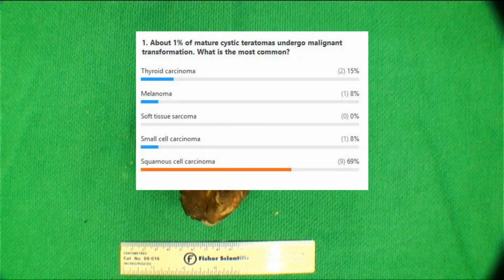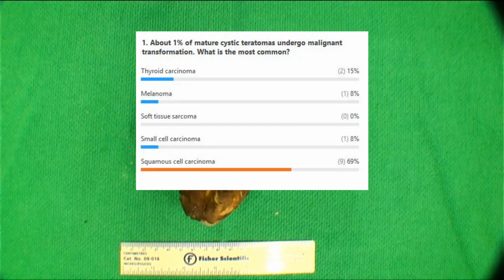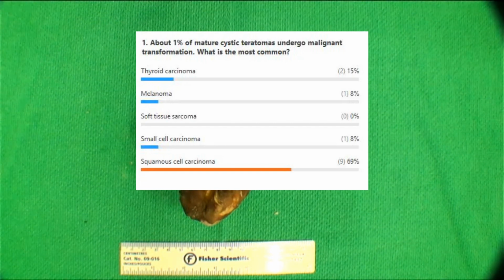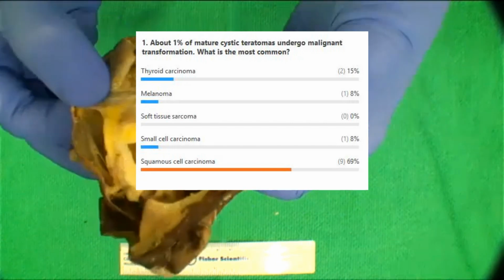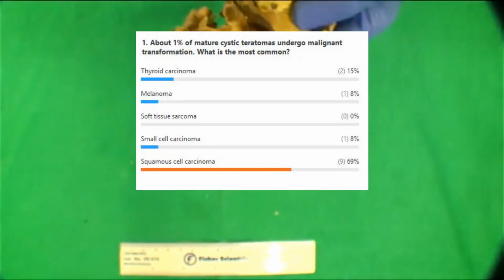Okay, about 1% of these dermoid cysts undergo malignant transformation. What is the most common? And it's for this reason that we want to put through these Rokitansky nodules. So yeah, most people got the right answer in that squamous cell carcinoma is the most common malignant transformation. Mostly because, as you probably know, the most common component of dermoid cysts is skin. So that just makes sense.